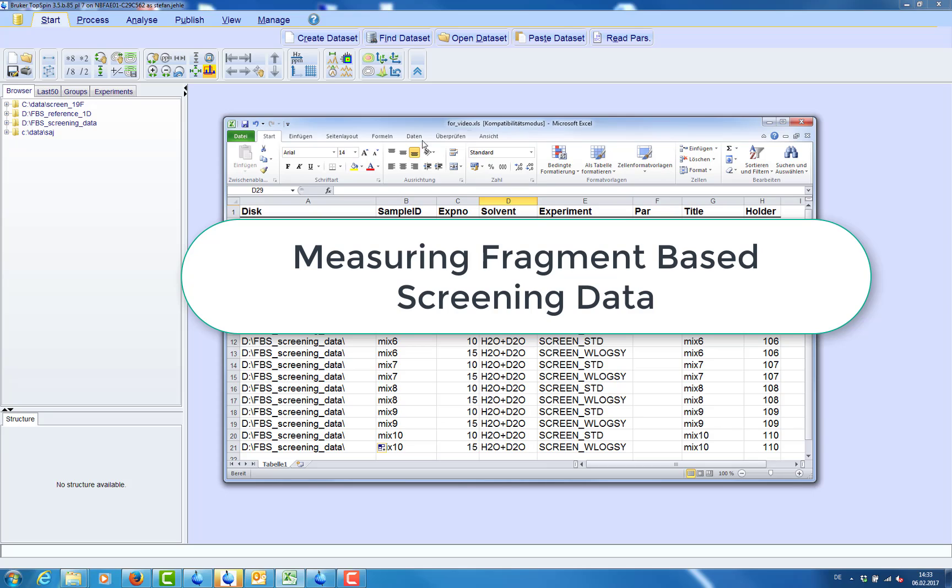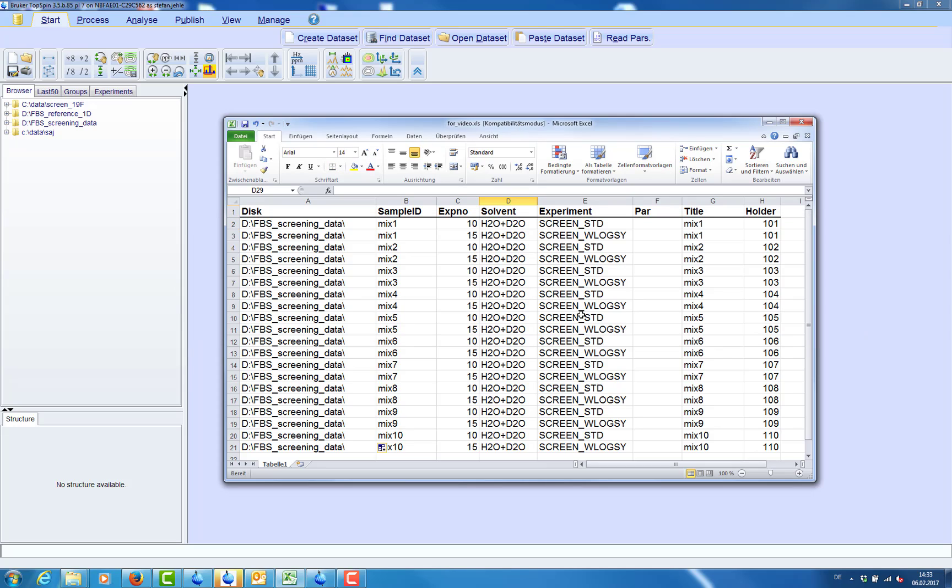We start our screen with an Excel spreadsheet that contains the data storage location, sample ID, which is the dataset name, experiment number, experiment type, and the position of the sample for which the data in each line should be measured.